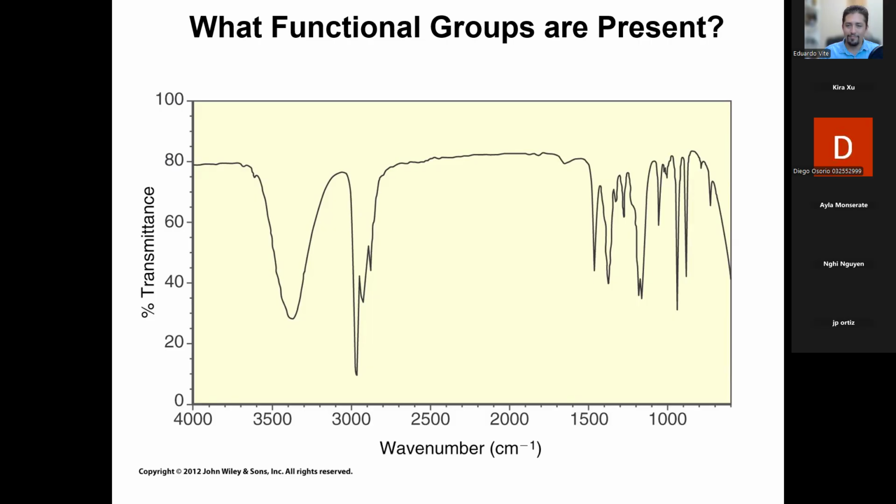Is there an OH group? There is an OH group. Hydroxyl? Where is it? The very left. Be specific with the number. Read the x-axis. At 3400. Excellent. Thank you. Yes. At 3400 wave numbers, there is an OH broad, medium, strong stretch. So this right here is OH.